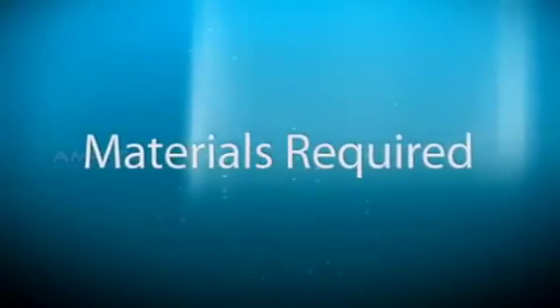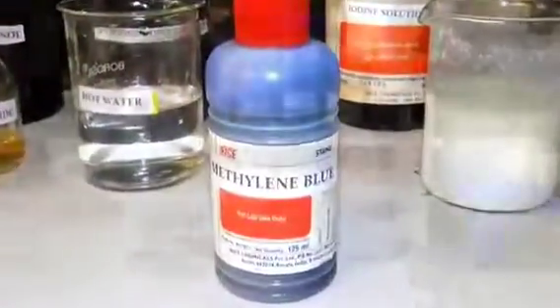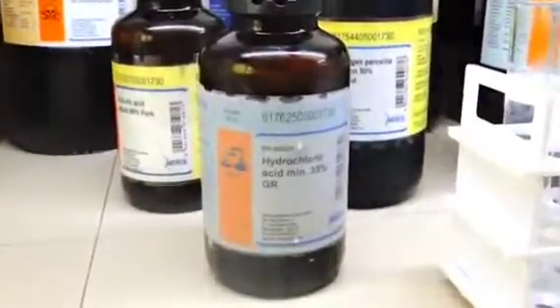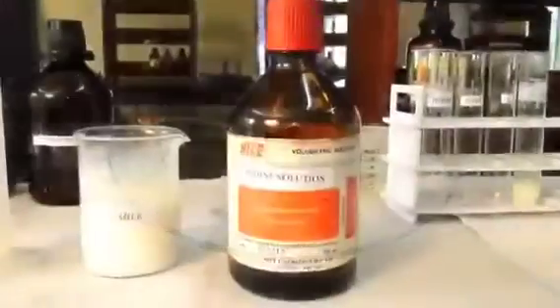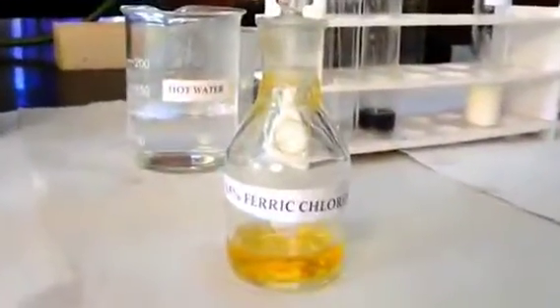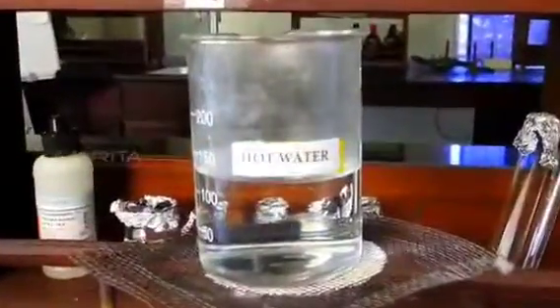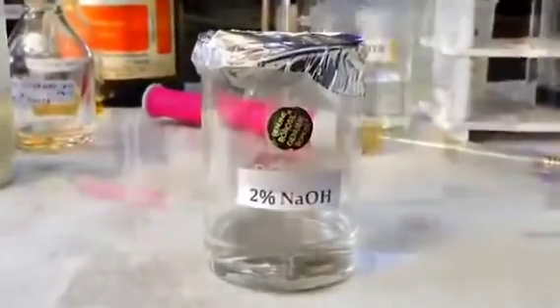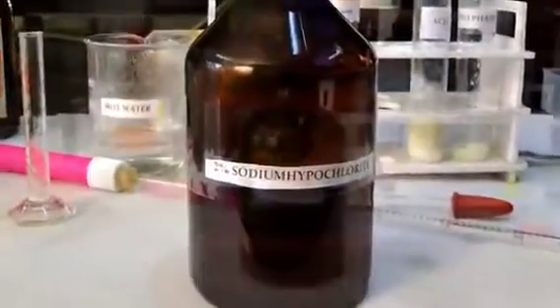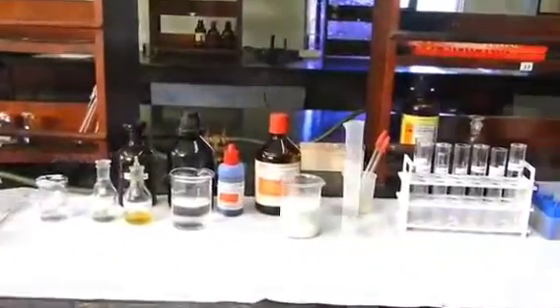Materials required: milk, methylene blue, test tubes, water bath, concentrated HCl, resorcinol, iodine solution, concentrated sulfuric acid, 0.5% ferric chloride solution, phenolphthalein indicator, hot water, 2% sodium hydroxide, 2% sodium hypochlorite, 5% phenol. Procedure: arrange the required materials on the lab table.